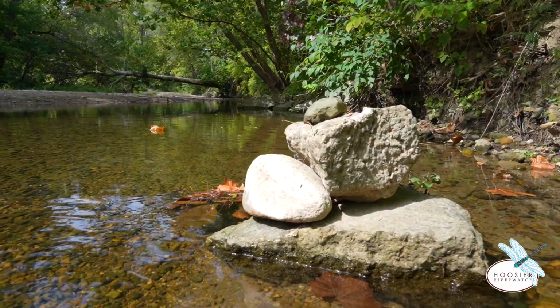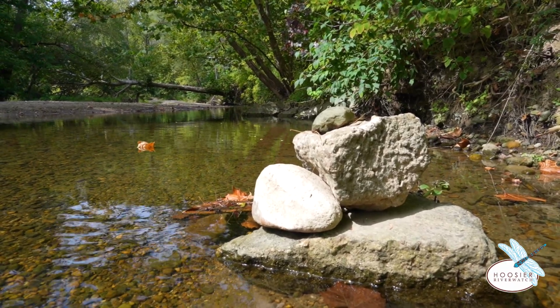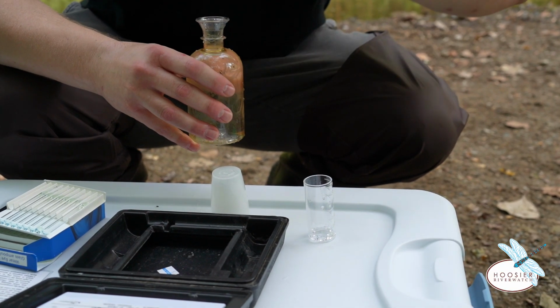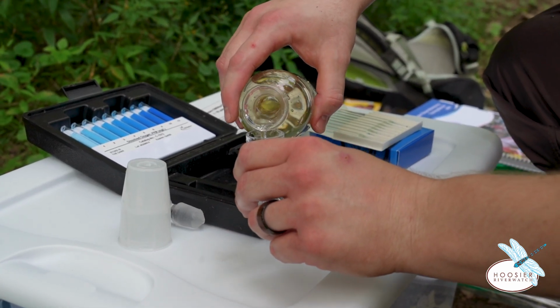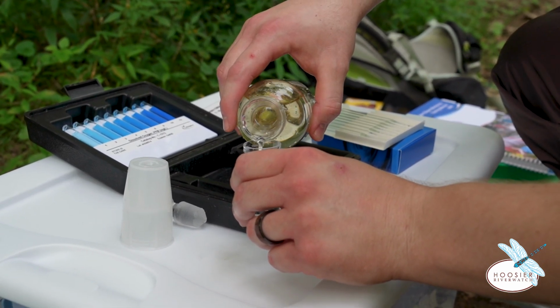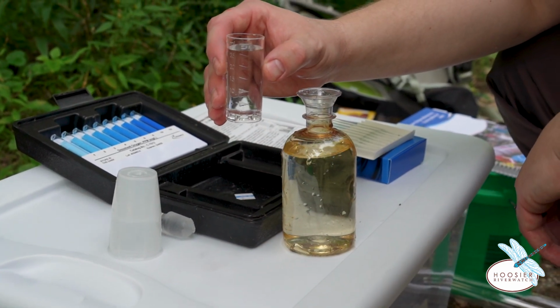Place the bottle in a dark room temperature location, like a cabinet or drawer, for 5 days. After 5 days, use the Chemetrix dissolved oxygen test kit to measure DO in the BOD sample. Subtract the DO level of the BOD sample from the original DO level taken 5 days earlier.